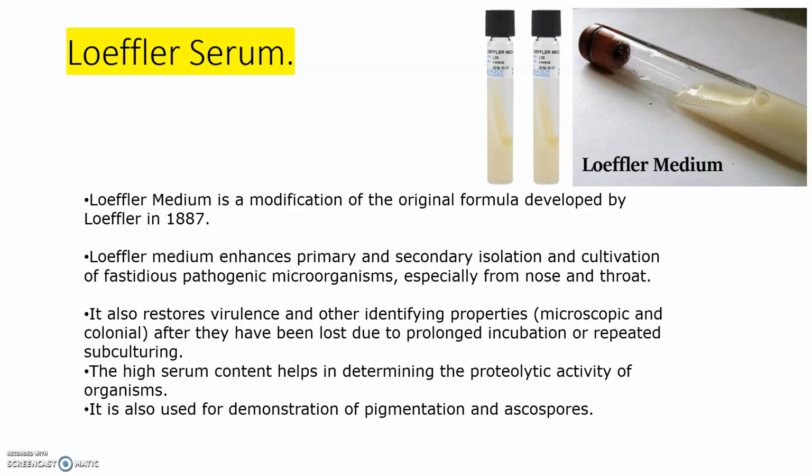The Loeffler medium enhances primary and secondary isolation and cultivation of fastidious pathogenic microorganisms, especially from the nose and throat. It also restores virulence and other identifying properties after they have been lost due to prolonged incubation or repeated subculturing. The high serum content helps in determining the proteolytic activity of the organisms. It is also used for the demonstration of pigmentation and ascospores.